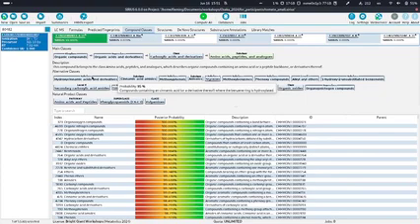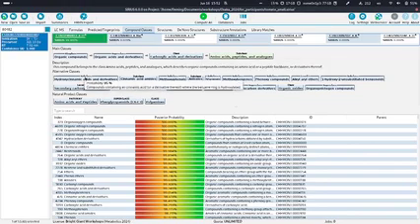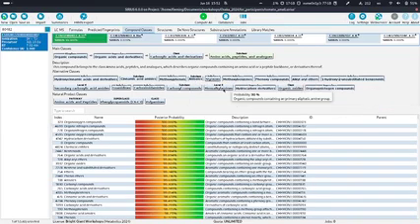So your compound can belong not only to one kingdom, one superclass, one class, and one subclass, but you will see all the alternative classes here in the middle. And it's always a very good idea to also look at these alternative classes. If you hover over this, you can see the probability, so you can see that also for all these alternative classes, we really predict them to be present. So alternative doesn't mean it could be this or this, but it really means it's both.